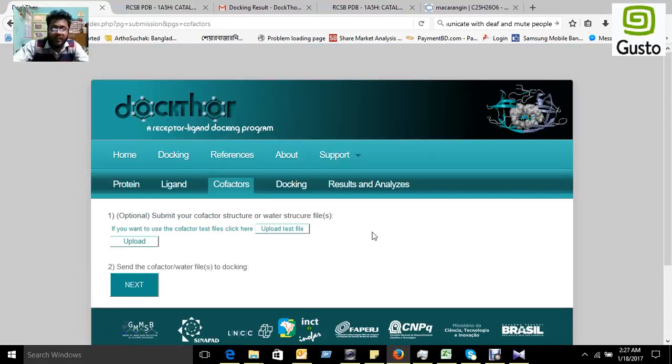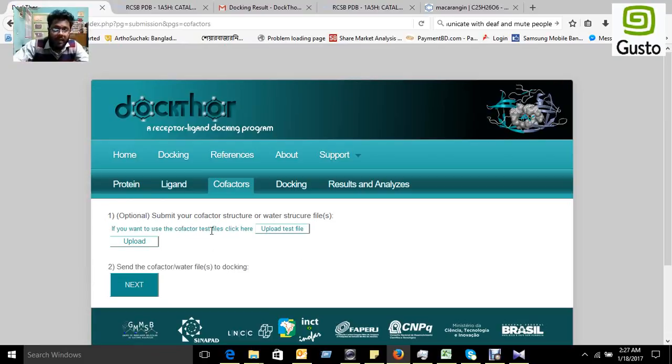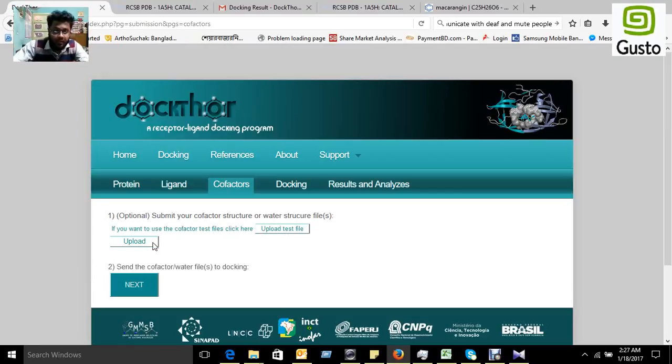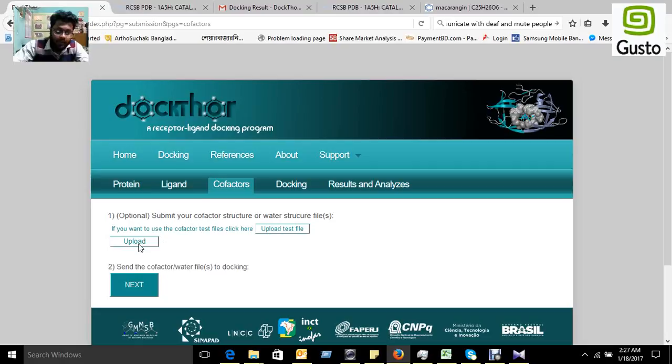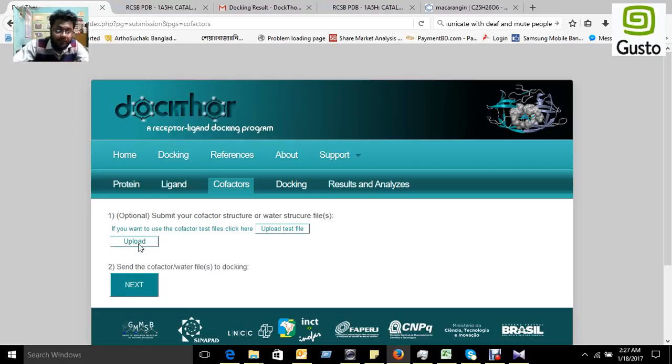All things are set up. Now you can also add water structure or cofactor structure. You can add them in this upload site, both of them or separately, and then you can press the next button.